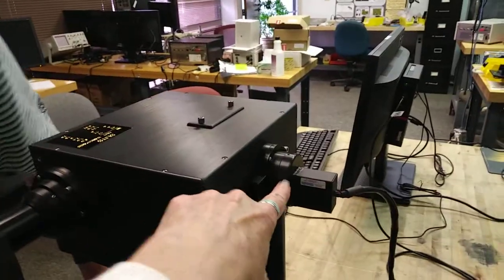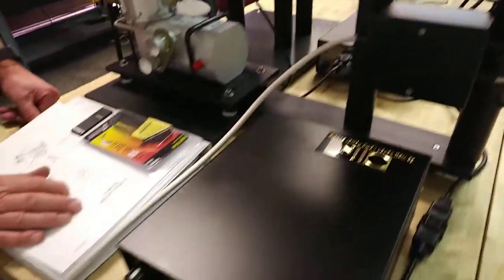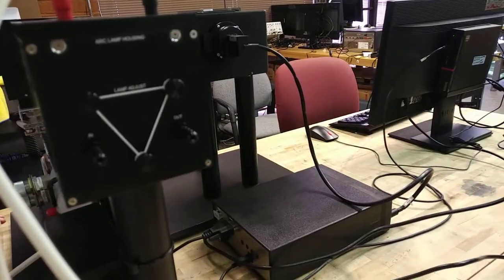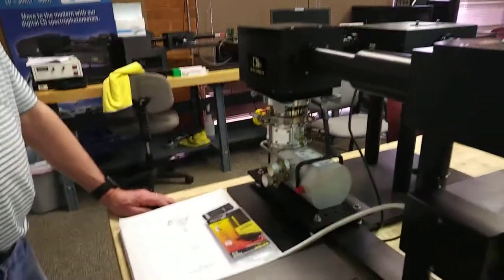And this, of course, is your photon counter — that's your detector. This is your xenon lamp power supply. And then this is the control box, which controls the photon counter and the movement of the monochromator. Thank you so much.